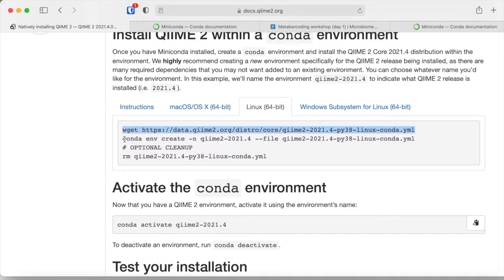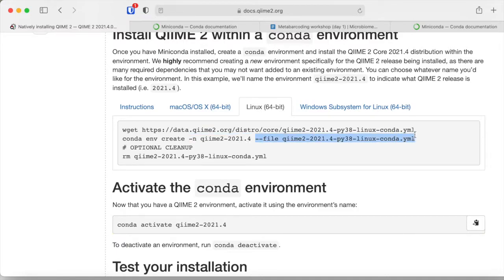Now we can use conda create with the -n flag. I suggest keeping the version name as-is, so that every time you know exactly which version you installed and which file was used to create the environment. I will copy the second part of the command and use Mamba instead.